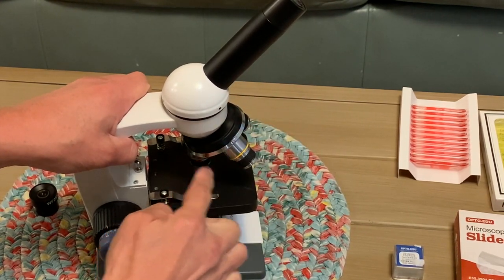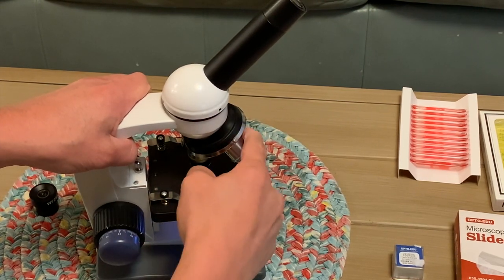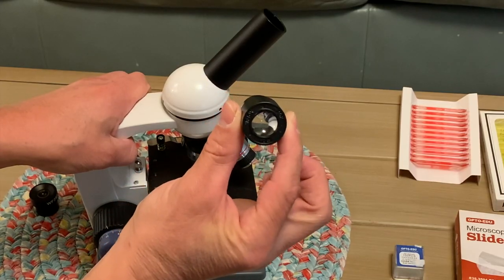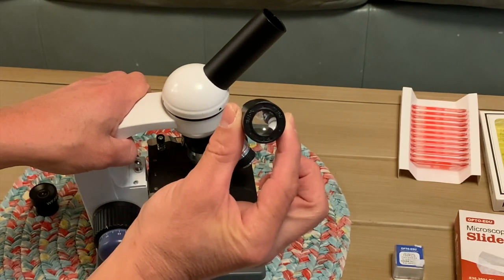This one is a 4x magnification, this one is 10x magnification, and this one is 40x magnification. In your eyepiece at the top this is a 10x magnification. So it will magnify the 4x to 40, the 10x to 100, and the 40x to 400.